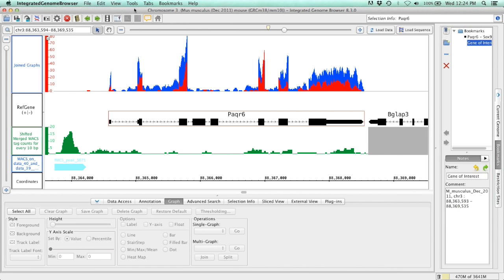And that list of bookmarks you can actually export. So you can export those bookmarks and then import other people's bookmarks. So if you needed to share that list with colleagues or students, or if students wanted to share it with PIs, or following this workflow, you can go from your raw FASTQ data to align data very quickly.